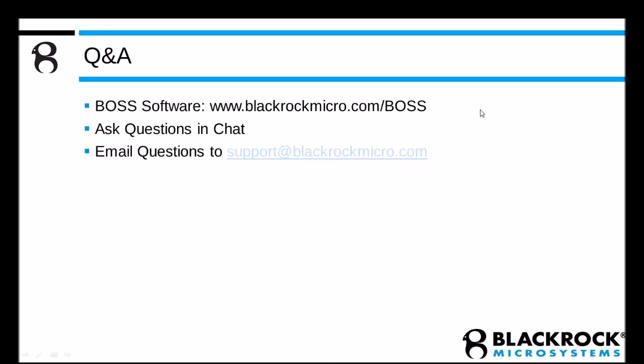These are all things that you might want to maintain in your sorted spike data after you extract spikes from a continuous file. To answer this user's question, if you extract spike data from a continuous data file, BOSS will automatically attempt to find the neural event file for that session and put that sorted data in that neural event file. So now you have your sorted data and all of your experimental event data in the same file.